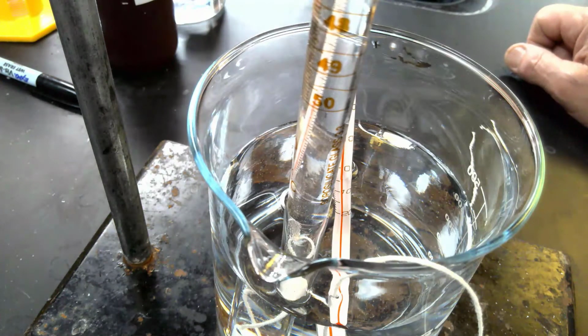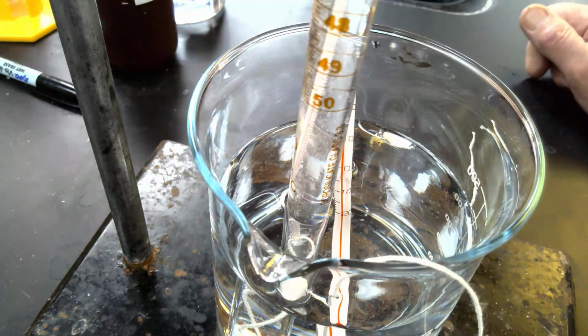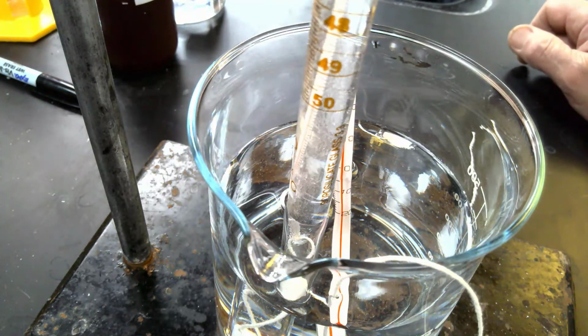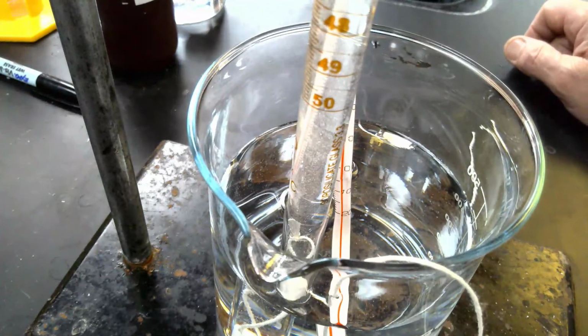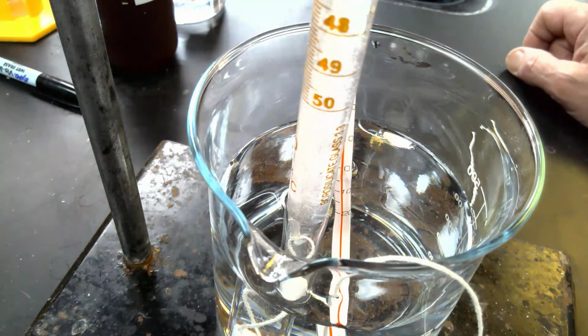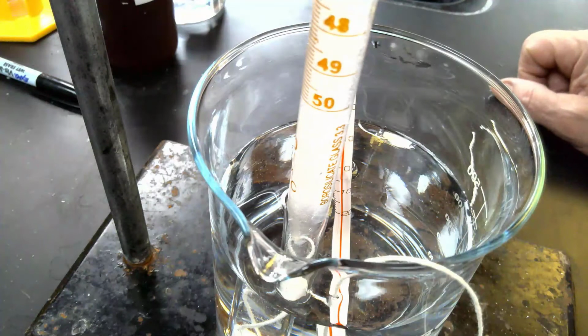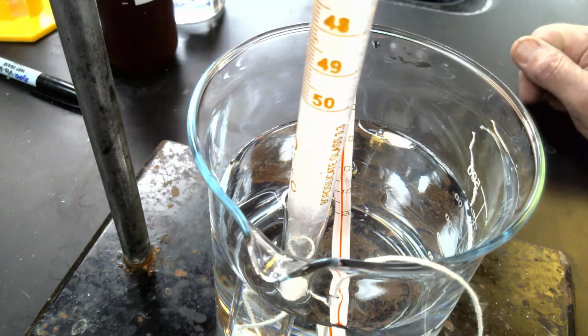This experiment will run until the magnesium has totally dissolved, and we will get a volume of hydrogen in our eudiometer. Again, the string is just holding the magnesium at the bottom of the eudiometer. Otherwise, it would have floated up to the top and put an end to your experiment. The cotton, again, is just holding the string in place. No function at all.